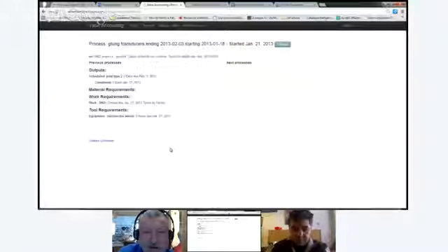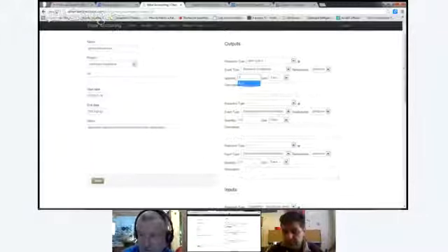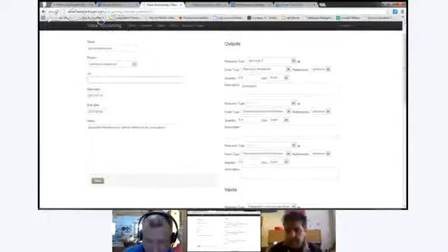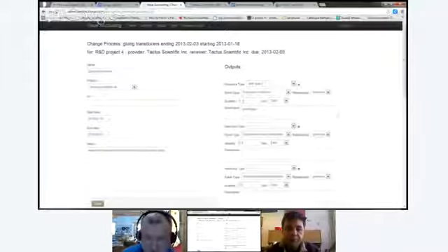But there's a problem with recipes in that respect right now. And you see here, if I want to erase the quantity, I put 0. For the resource type, I put 0 and I save. And when I go back to edit it, it's again 3. Bug.